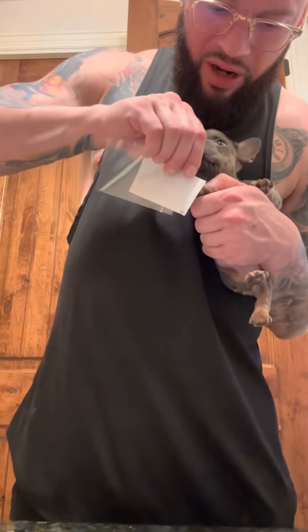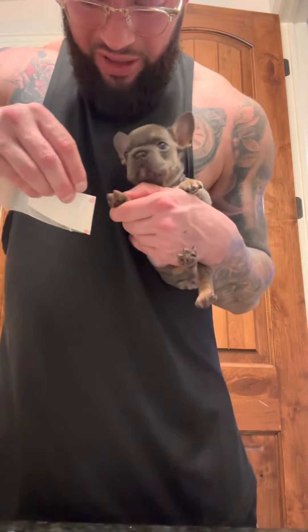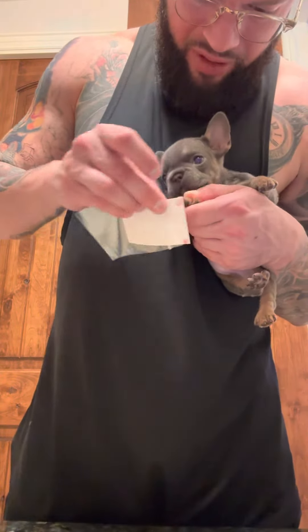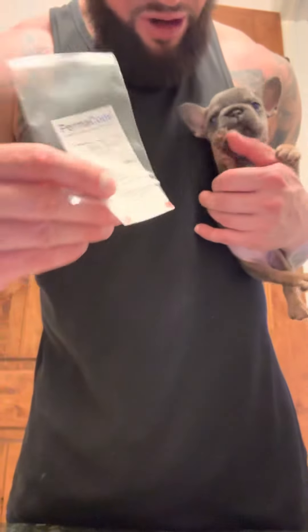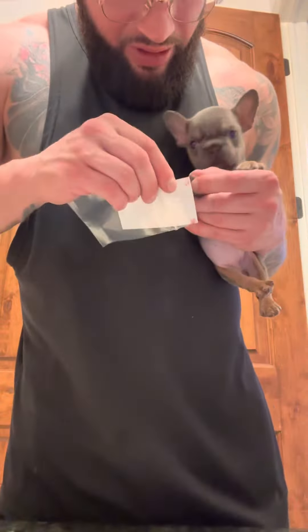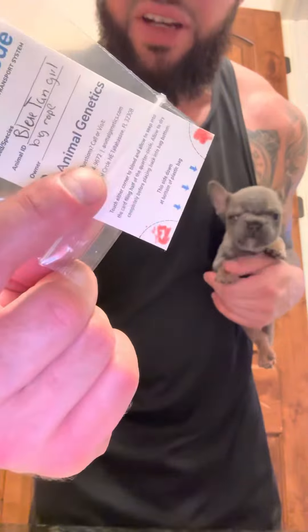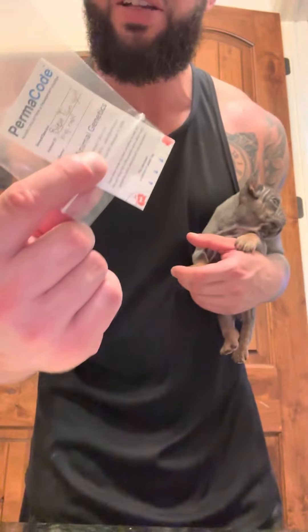Just barely, barely into the pink on the nail and you'll get enough blood. You can see there's that little bit of drop there — she's already almost done bleeding. This was barely enough, but hopefully it's enough. There you go — a DNA blood sample. Thank you guys for tuning in.